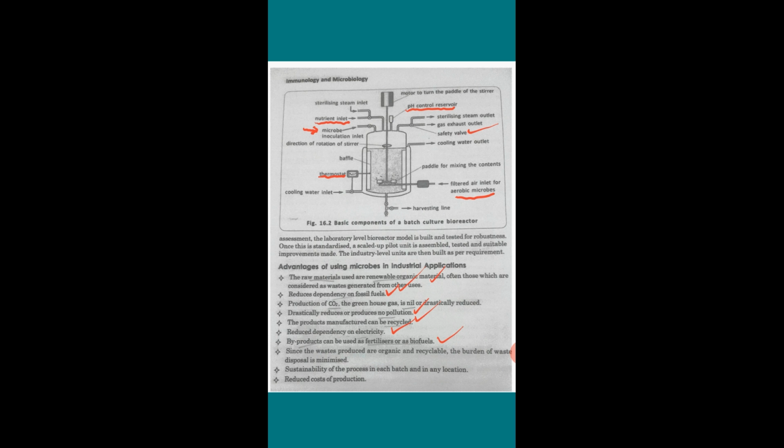Since the waste produced is organic and recyclable, the burden of waste disposal is minimized. That's a very good point, because in every industrial setup there will be some effluent and waste. They have to be discarded without any harm to the environment. But since the waste produced in the bioreactor is organic and recyclable, the microorganisms in the environment will act upon and degrade that. So the burden of waste disposal or waste management is comparably nil.